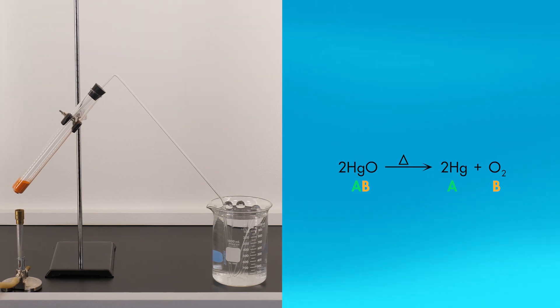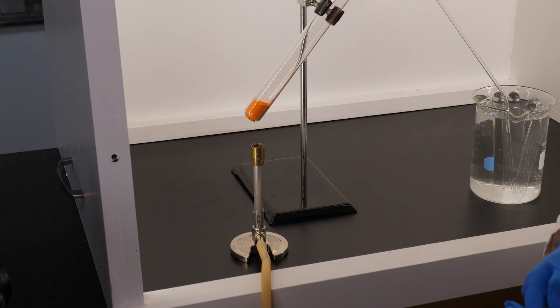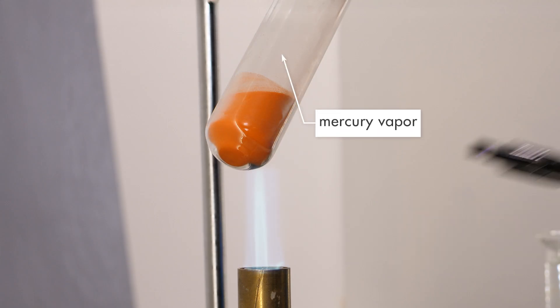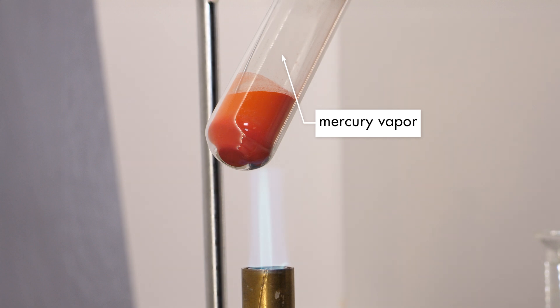Here is the chemical equation for the decomposition of mercury(II) oxide. Notice the triangular symbol above the reaction arrow in the chemical equation. This symbol indicates that heat must be applied to cause this reaction to begin. When the compound is heated, thermal decomposition begins. The heat energy breaks the chemical bonds between the mercury and oxygen, and mercury vapor is formed.